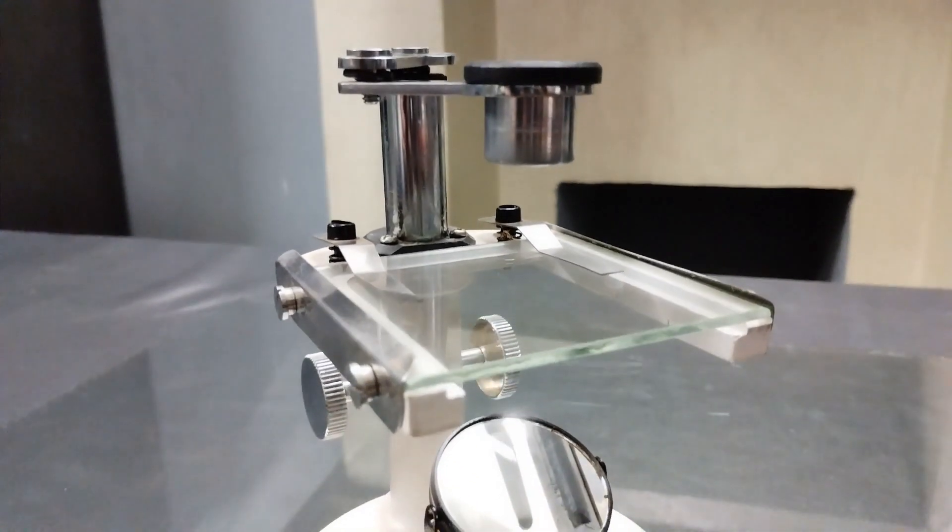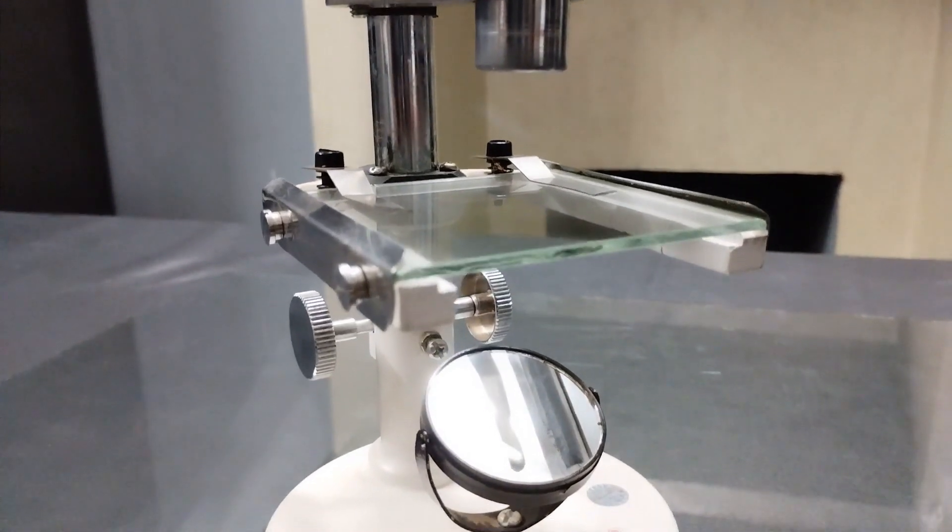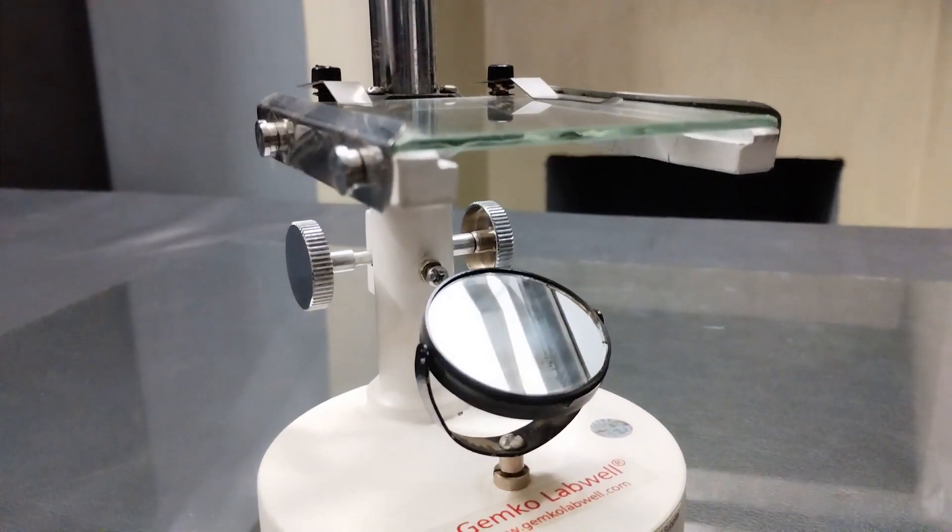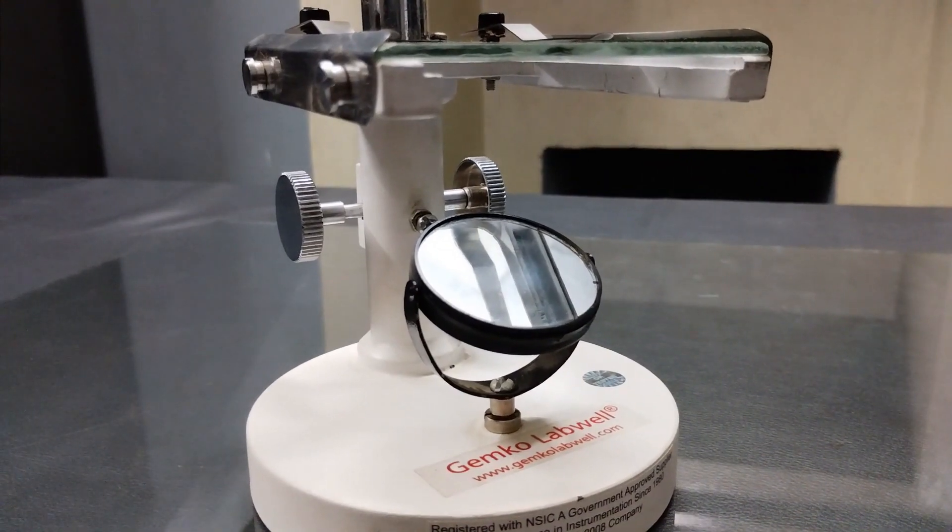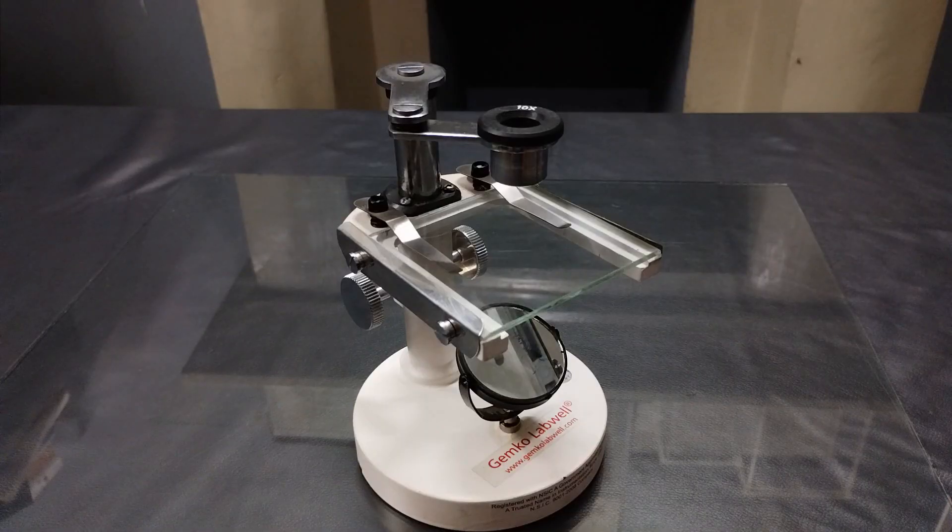Next to the iconic hand lens that we're all familiar with, the dissecting microscope is one of the simplest and least sophisticated magnifying instruments with a modest magnification range and a simple mechanical construct.